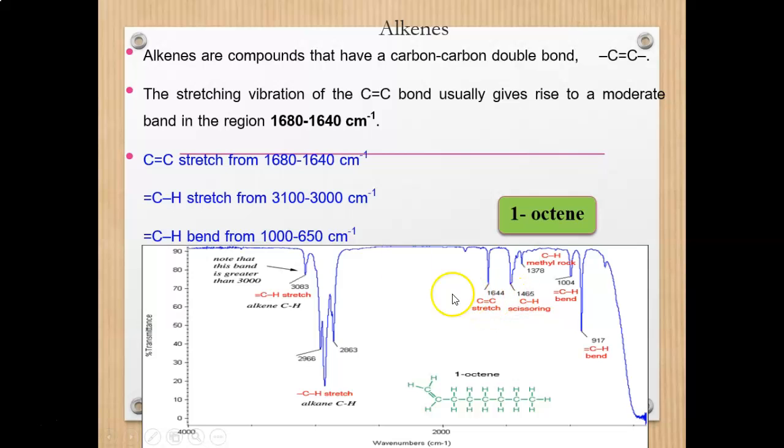So di samping itu awak kena tengok juga peak lain. Peak yang muncul ni warna hitam ni kan. So awak determine lah number dia ni, kalau dalam region CH awak letak lah. Dia adalah CH region macam tu. Make sure tak lari daripada structure yang awak cari. Jangan tiba-tiba awak nak labelkan NH pula kan. NH tak ada dalam structure sini. So just ignore the other functional group. You just focus on the functional group of that compound you want to determine.